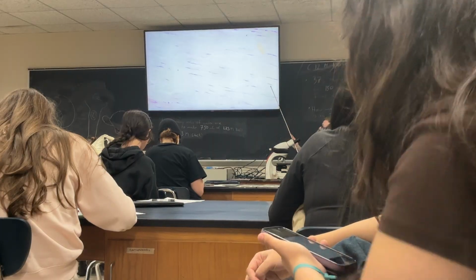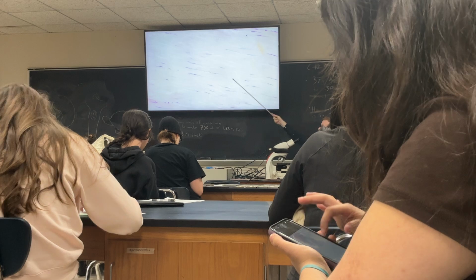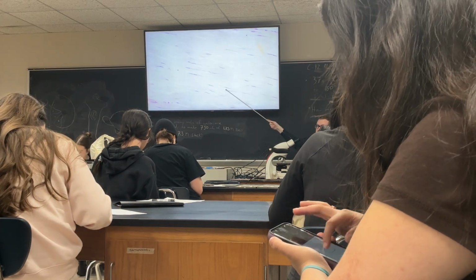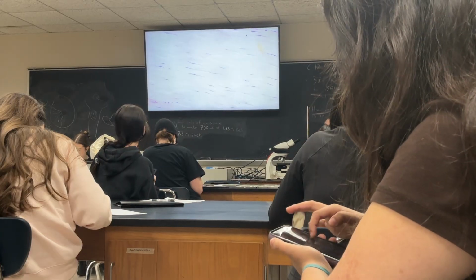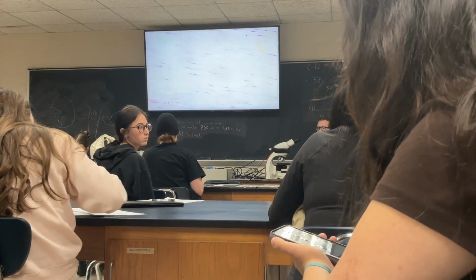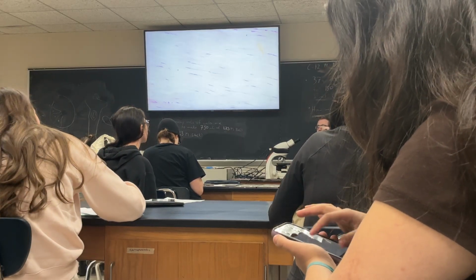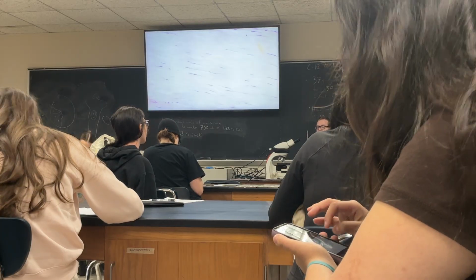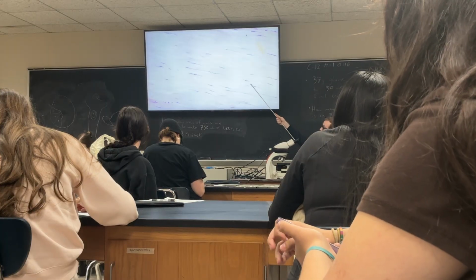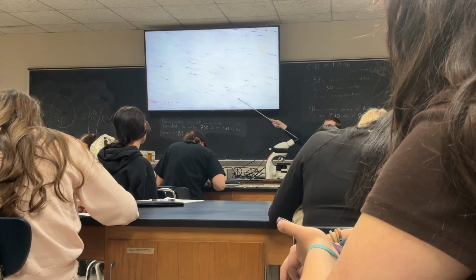Also, notice how flattened these nuclei are, right? They're crushed, because there's so much protein in between these cells that it doesn't leave any room for the cells to actually exist, and so they stay flat. Remember in cartilage, there's a lacuna, a little house for those cells to exist in. So in fibrocartilage, it might look very similar to this, but I'm going to see a lacuna. I'm going to see rounder cells because they're not as crushed, since they live inside their little house. Dense regular connective tissue has relatively few cells, and they're all going to be extremely squished like this.